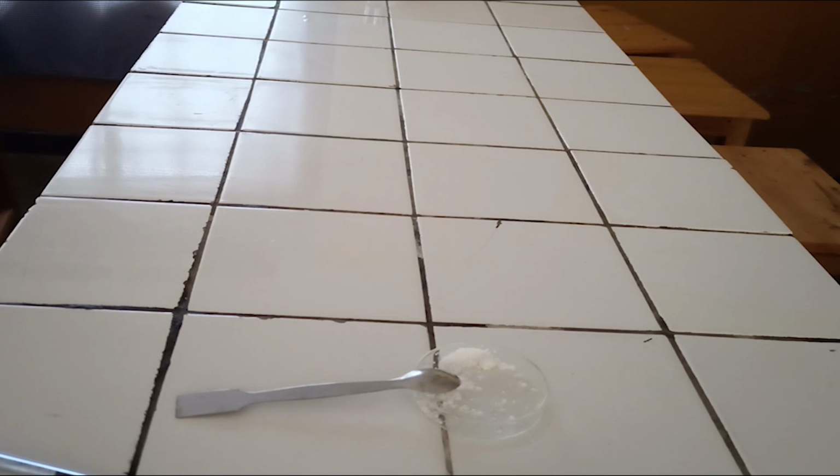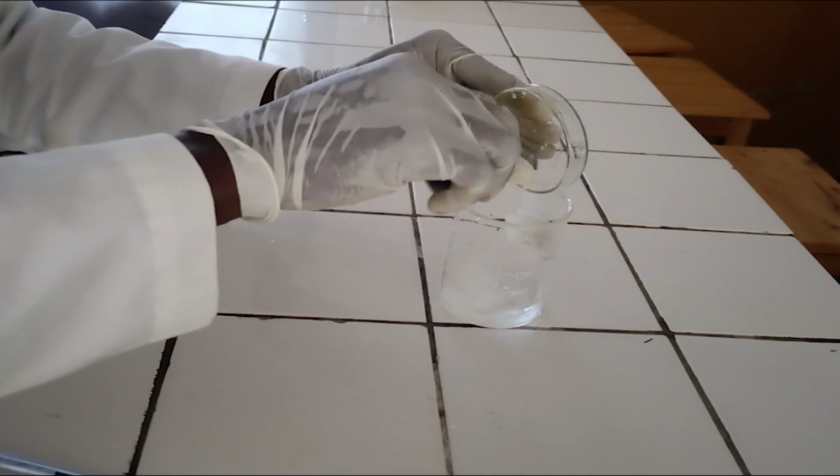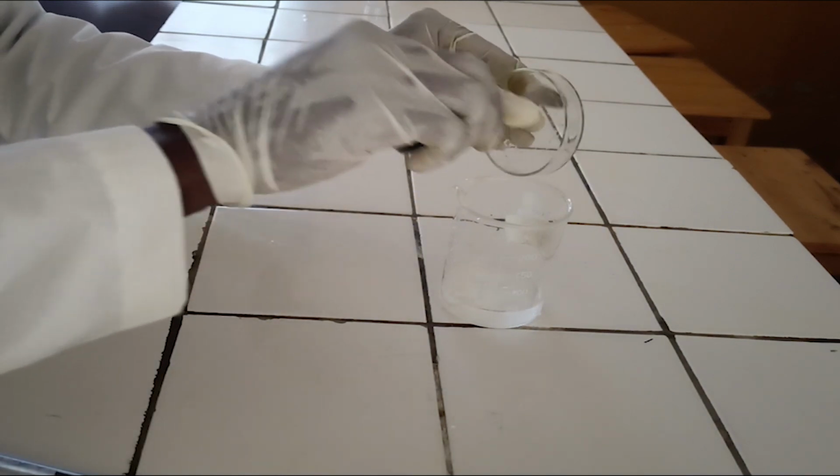Test for zinc ion. First step is observation. Salts of zinc ion are white. Second step, dissolve one full spatula of salt in 50 ml of water. When salts of zinc ion dissolve in water, they form colorless solution.